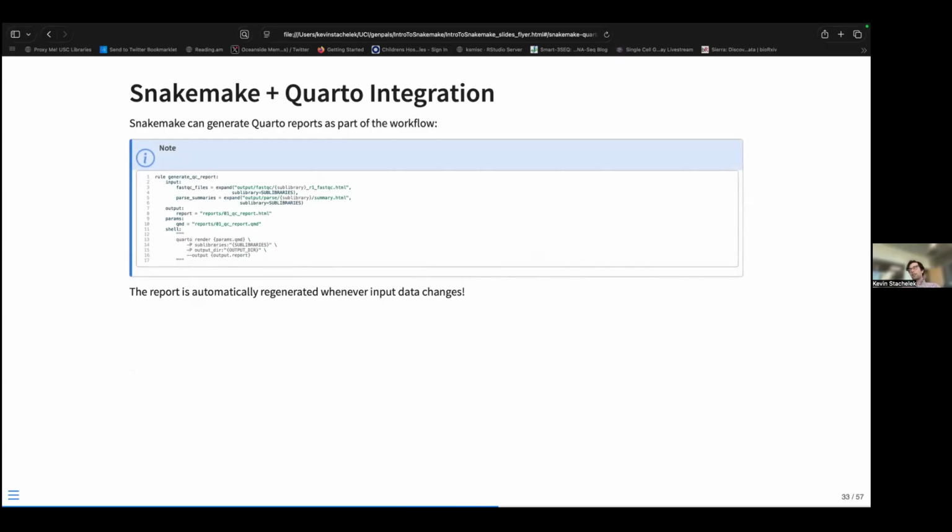I am reporting results in Snakemake by defining a separate rule to generate a report using Quarto. We don't necessarily need to get into all the details of how that works. If people are unfamiliar with how Quarto works, it's basically a way to make HTML files that describe, I made these slides with Quarto, for example, to specify them with code. So the advantage of this integration of reports with the workflow is that there isn't a disconnect between what you say you did and what you actually did, because you're eliminating that sort of manual step.